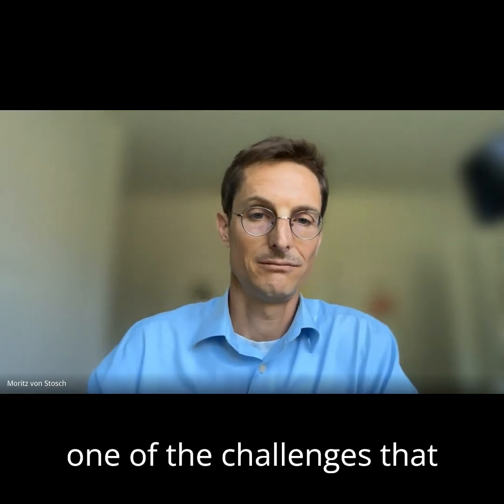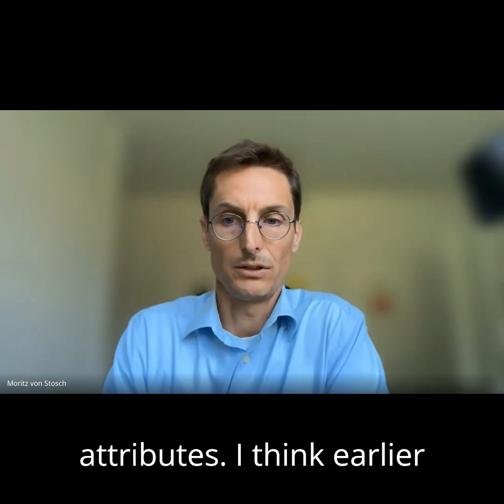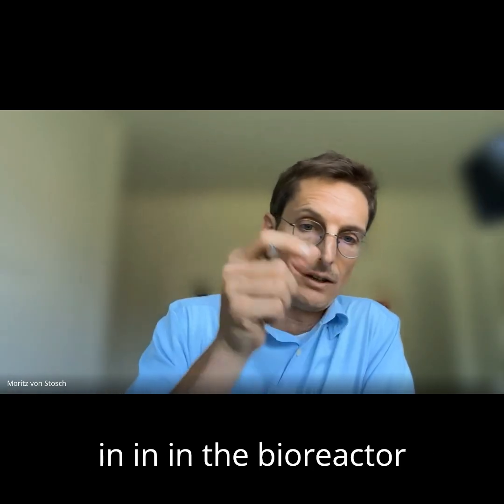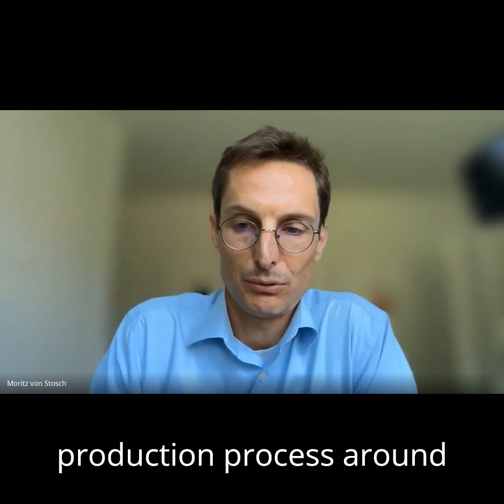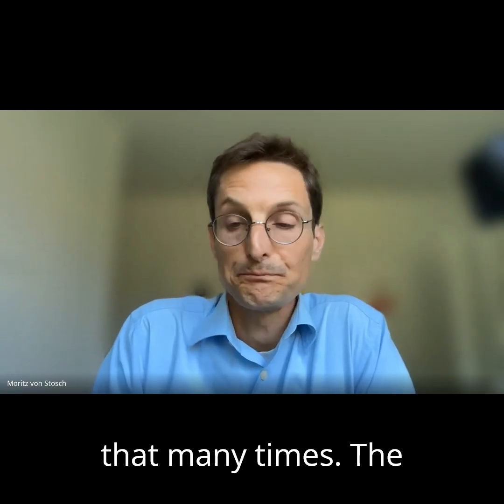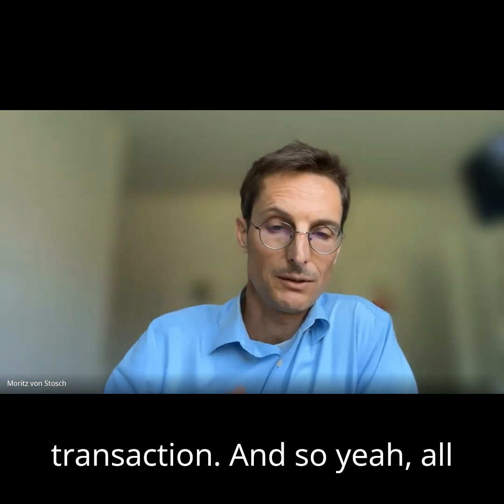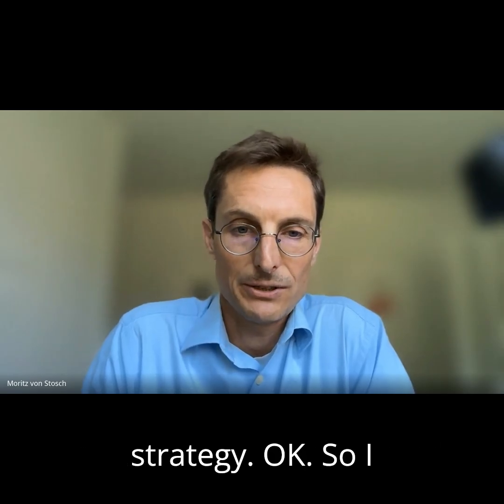So that is one of the challenges that arises. And then I mentioned material attributes. I think earlier, if you have variations in raw material, if you have variations in lots, or if you have variations in the n-1, so in the bioreactor or in the shake flask that you use in order to actuate your production process, right? That also leads to variations, and we have seen that many times. The expansion of cells might impact on the production stage, in particular on the transfection, and so yeah, all these steps need to be considered and considered also in the analytic strategy.